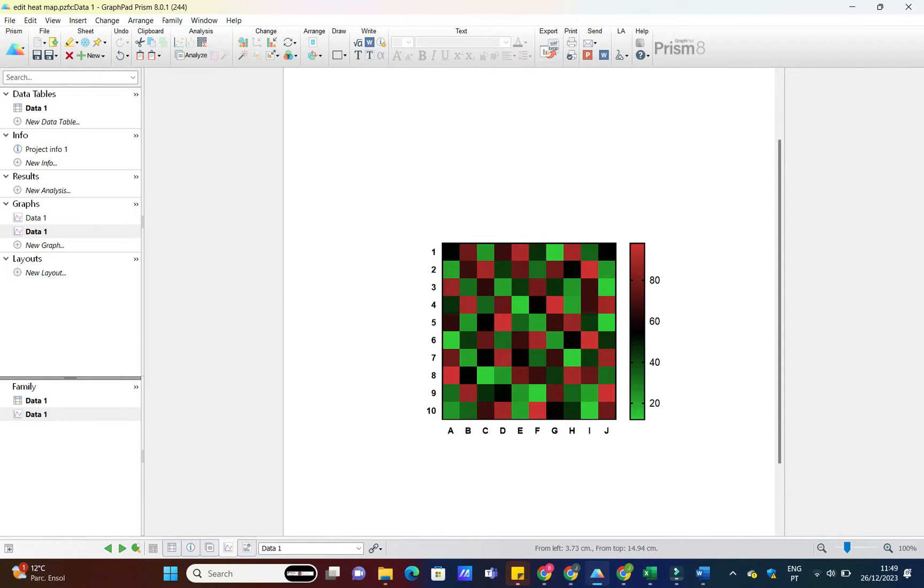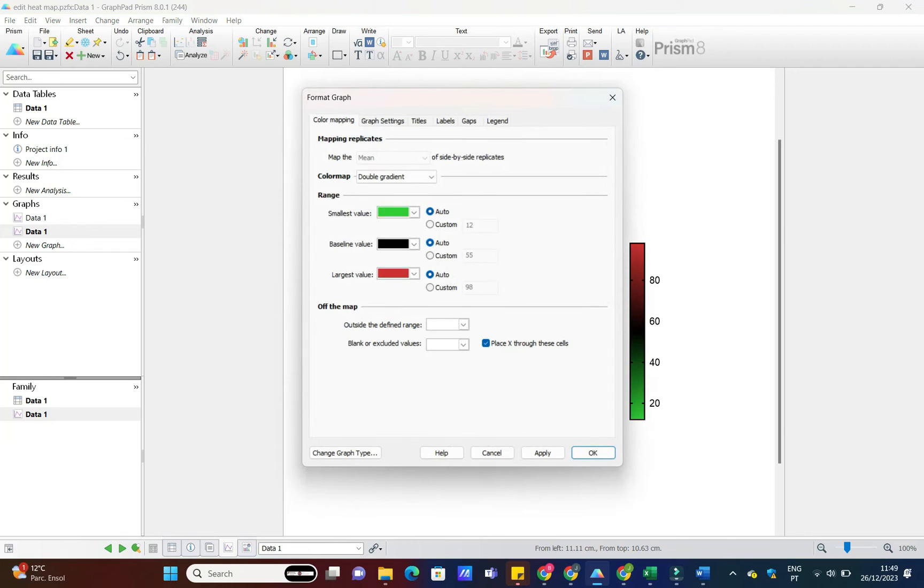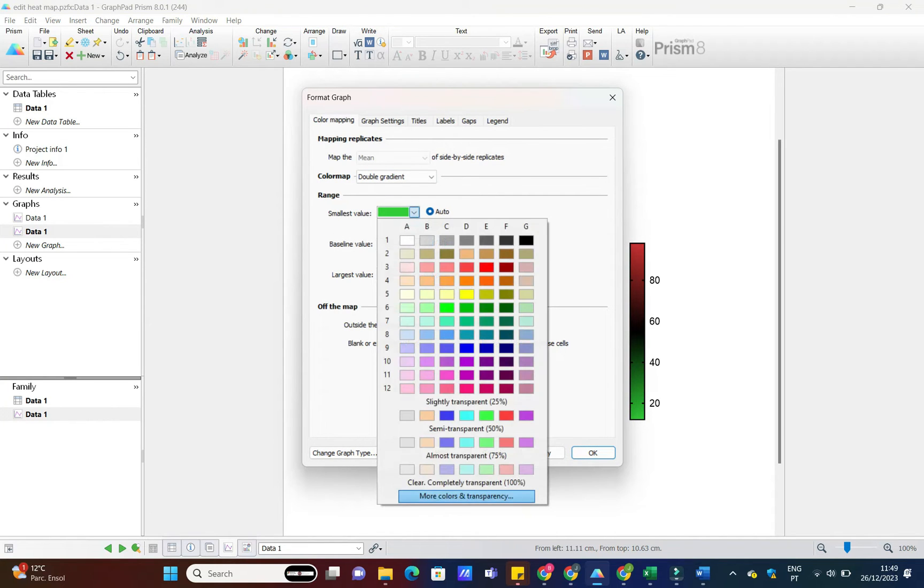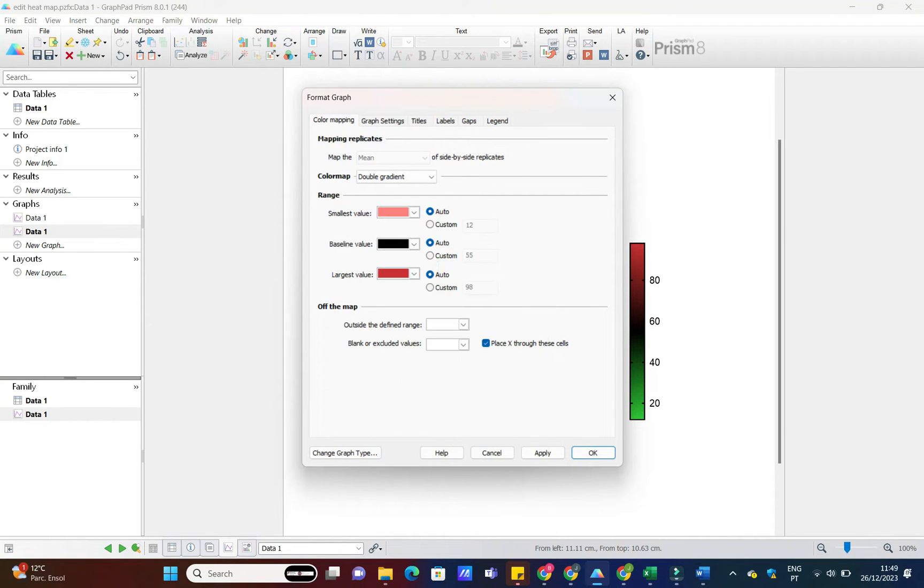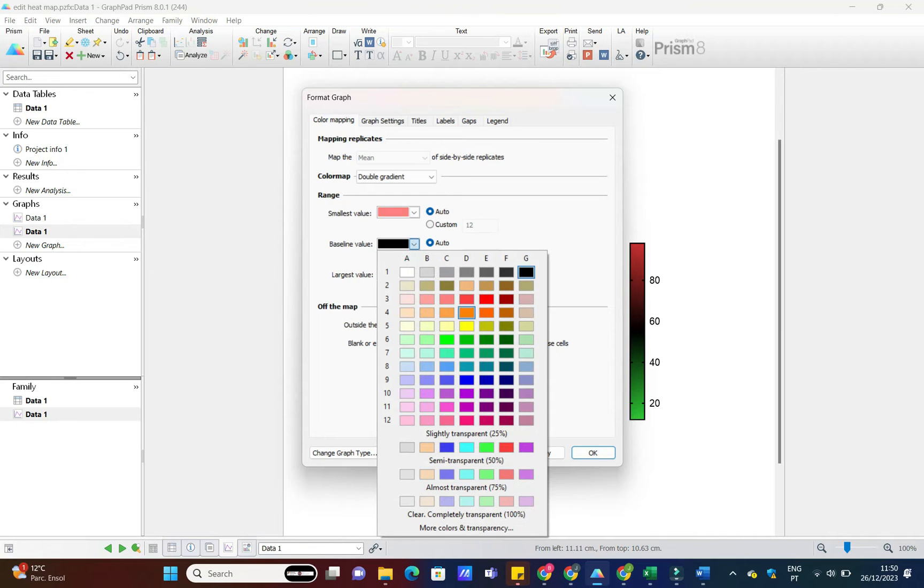Let's add some personality to our heatmap by customizing the colors. Head over to the Format tab, click Color Scheme, and choose from the preset options or create your own color gradient. This is where you can make your data visually striking and easy to interpret.